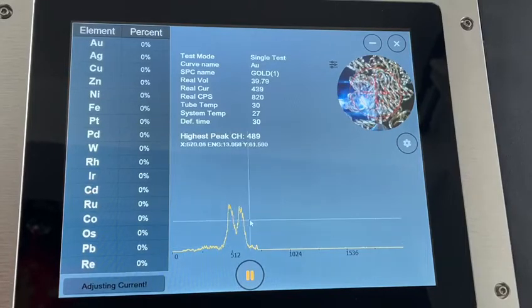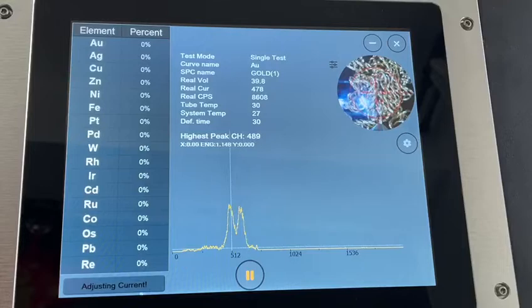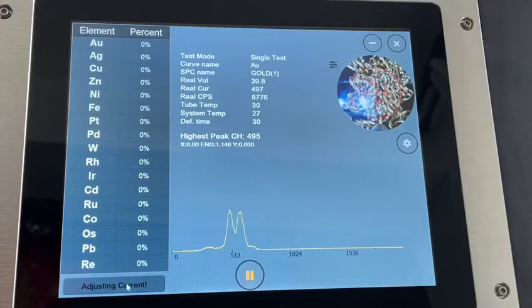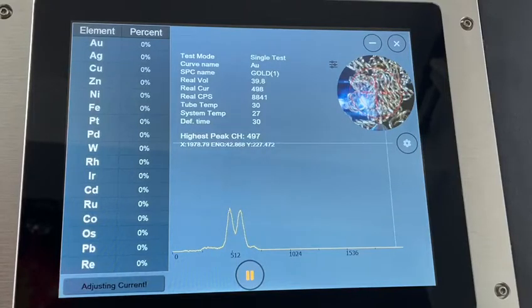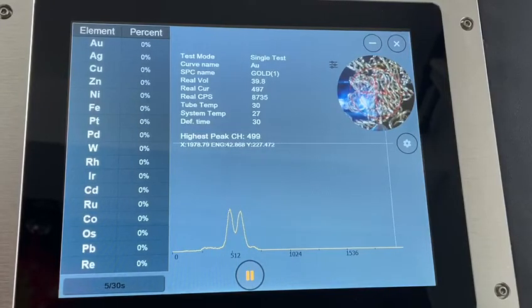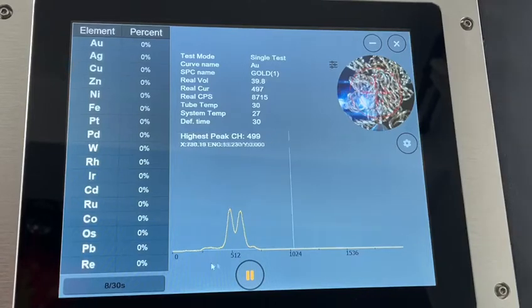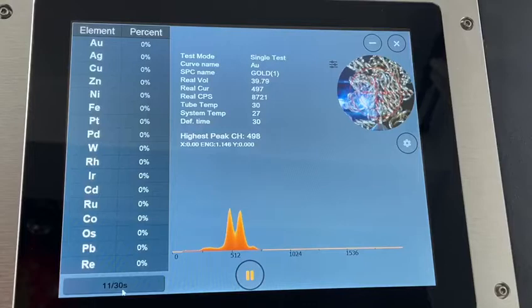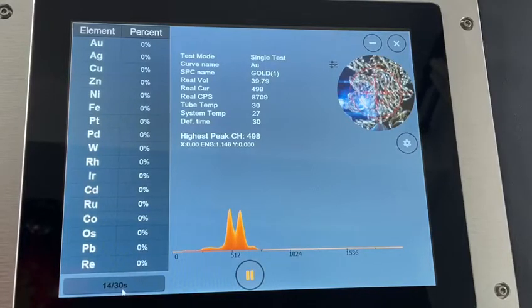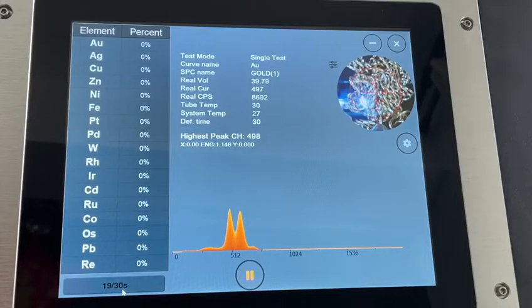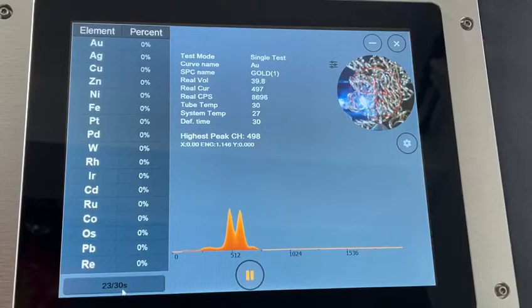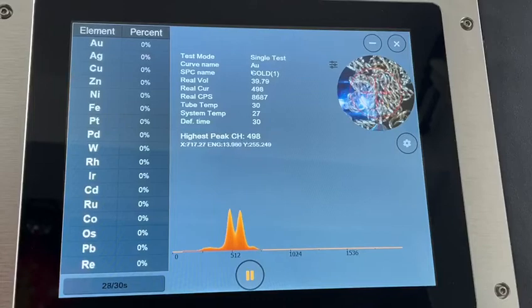You can see this peak is forming up now, and here's the testing time. You can see the sample chamber over here. Twelve seconds left, another 20 seconds to go. You can see the single test we tested.